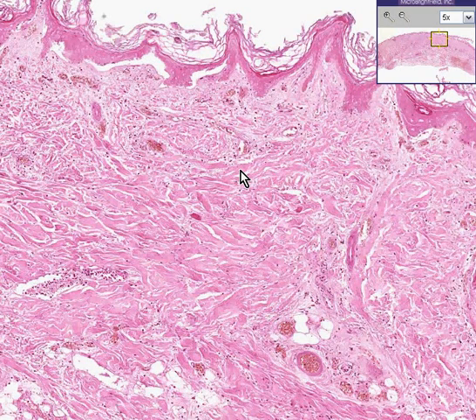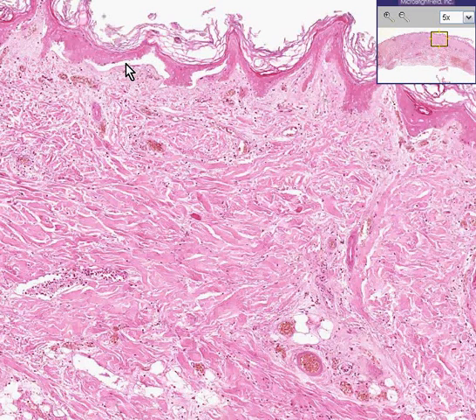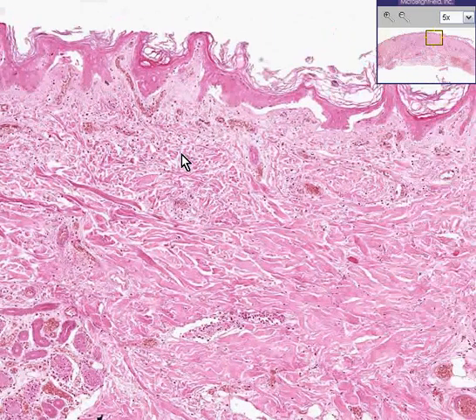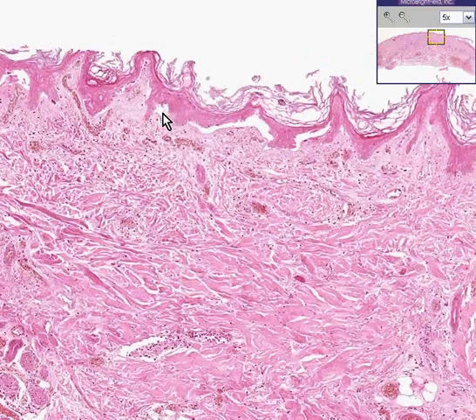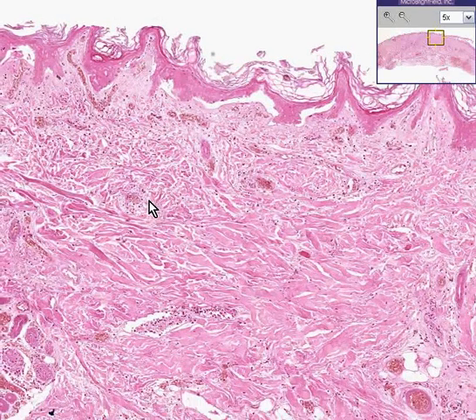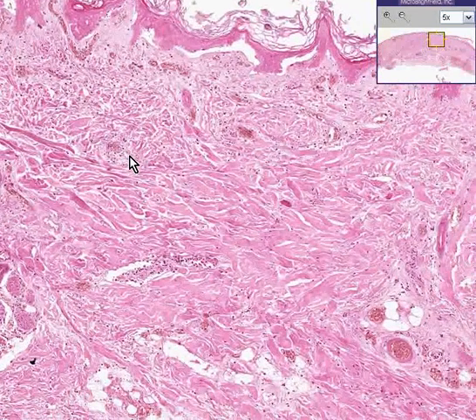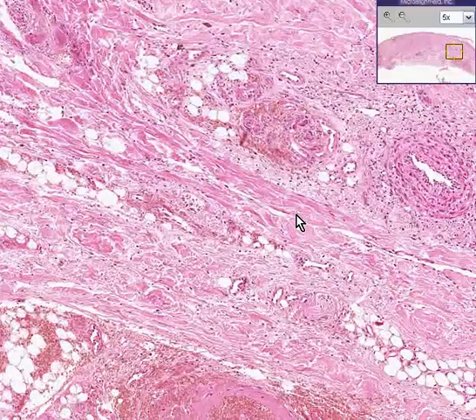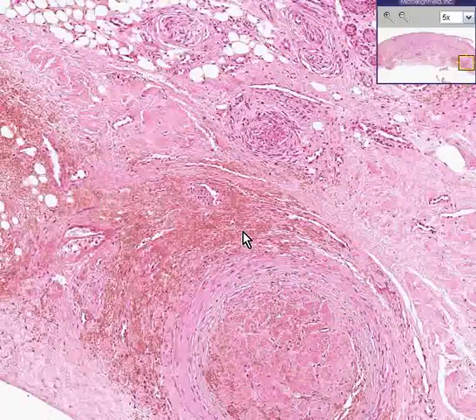Dry gangrene is generally a later stage than wet gangrene, and because we do not have too much by way of fluid here in any way, shape, or form — not much hemorrhage, not much edema, just coagulation necrosis — you call this dry gangrene of the skin. And it is very nice that we can see the reason why: we have a thrombus within a fairly good-sized blood vessel.